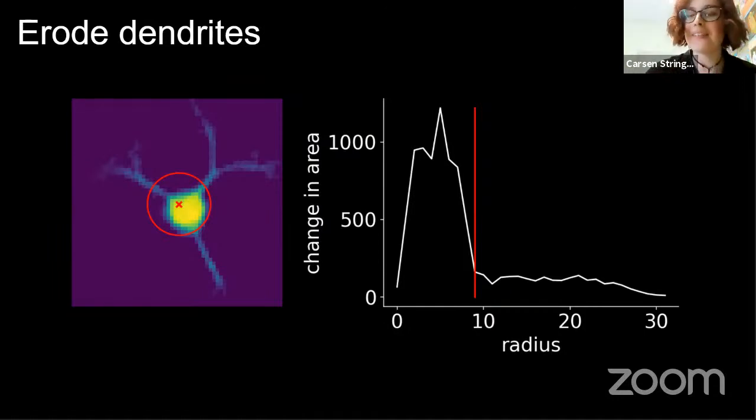Re-neuropil correction. What are your thoughts on the magical 0.7 coefficient versus trying to estimate the coefficient or other more source separation style approaches? Yeah, so that's a really good question. You can make those kinds of scatter plots of F versus F new to see where that correction coefficient should fall.